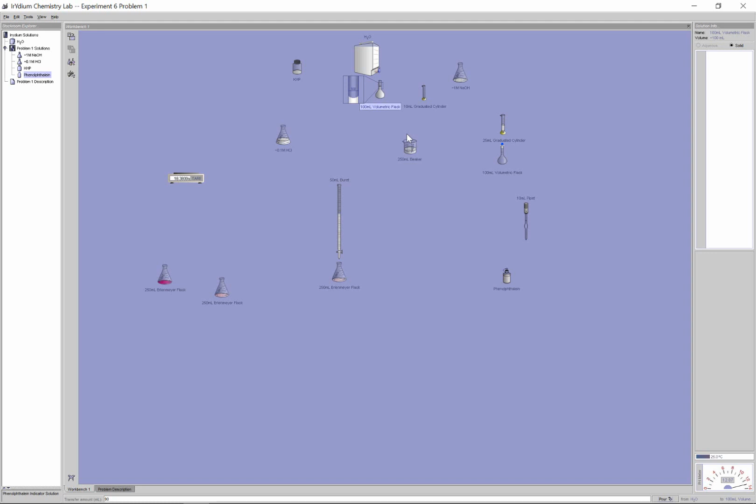When I get really close to the mark here, again, you'll take a water dropper pipette, and basically you're going to add it in really, really tiny fractions. So I'm about 98 right now in our simulation. Maybe I added in maybe 0.2 at a time here, just little squeezed droplets out of the eyedropper. And basically, I'm looking for the bottom of the meniscus to hit my 100 mils, maybe a little under there, and there we go. Remember, if you accidentally overdo it here, it's a little bit too dilute. Because I don't have that marking here, I now don't have the precision I want for a titration.